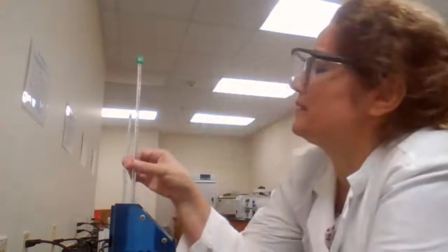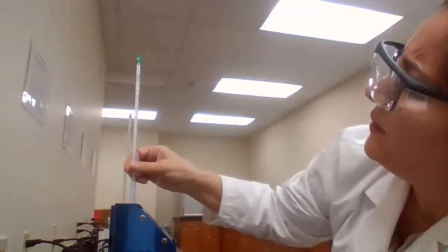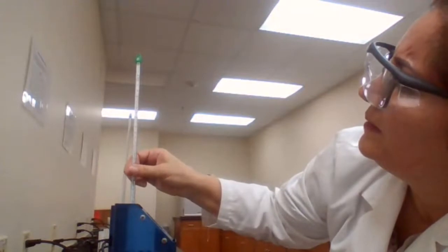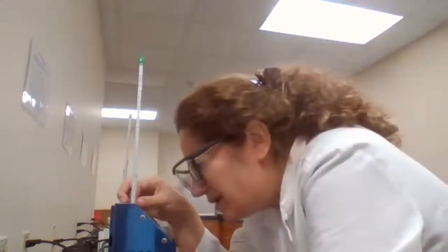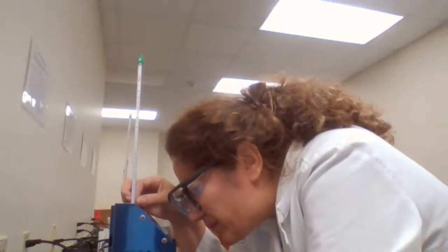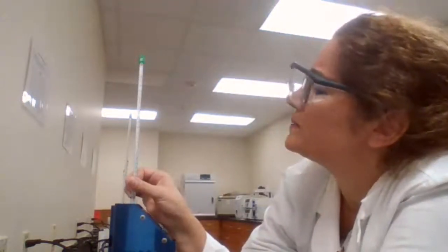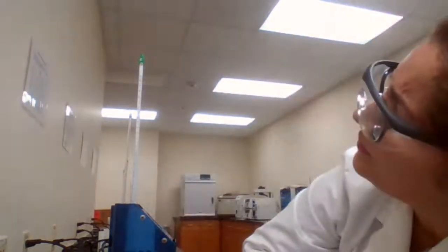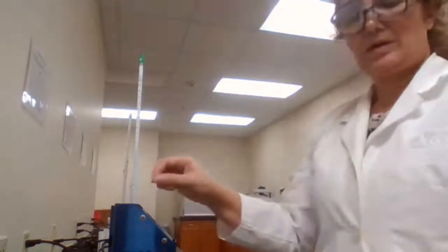Okay, initial melting 109. Completely melted is 112. So 109, 112.